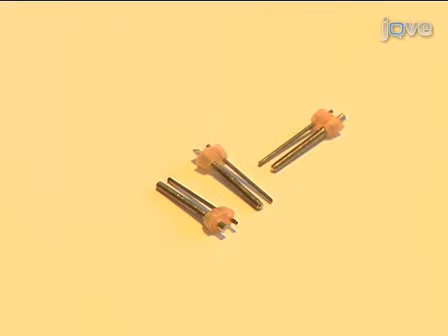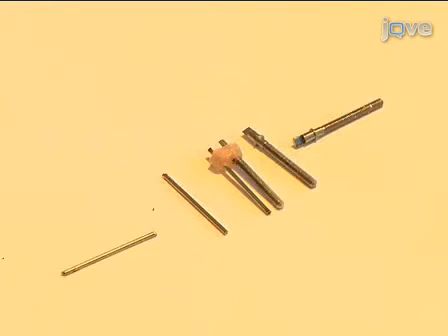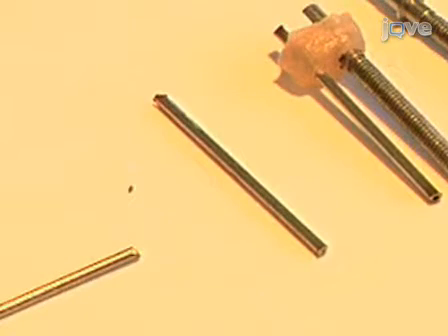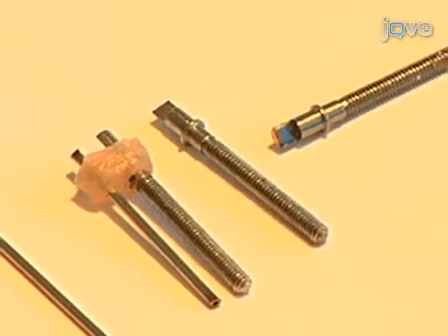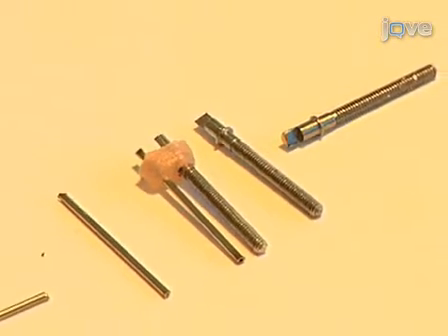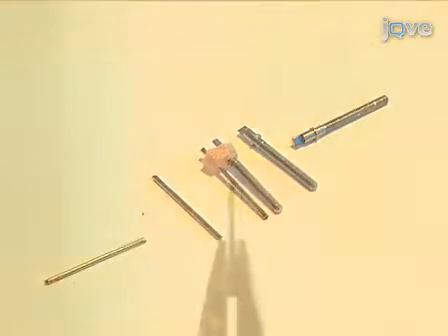Each electrode is advanced by its own microdrive, so we need to make 21 microdrives and then insert them into the plastic base. Each microdrive consists of a custom screw and a hollow support tube which are attached to each other with dental acrylic. The electrode will pass through the support tube. The screw features a non-threaded part with a small lip that is embedded in the dental acrylic and allows the screw to turn freely. In this way, as the screw is turned into the plastic base, it advances or retracts the electrode. The head of the screw is shaped like a half cylinder.